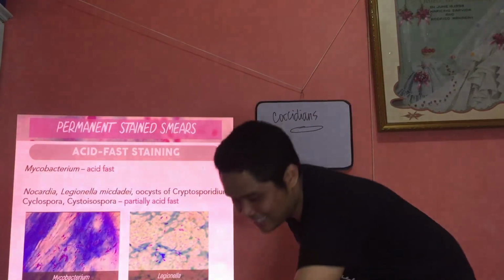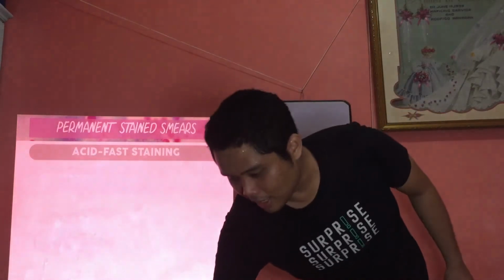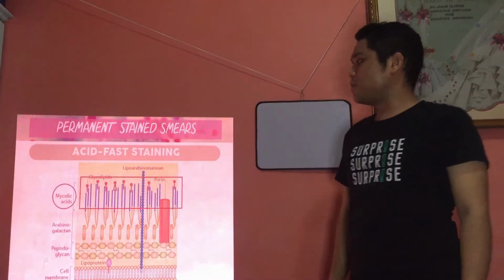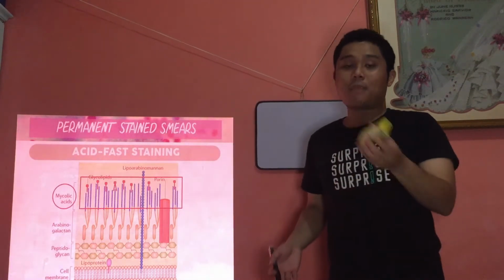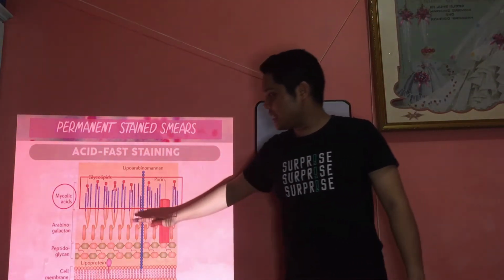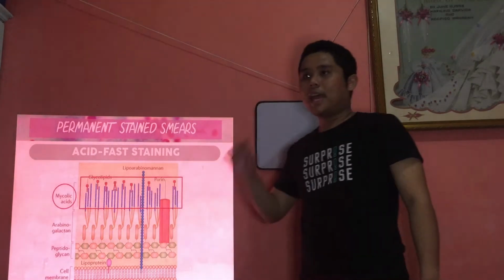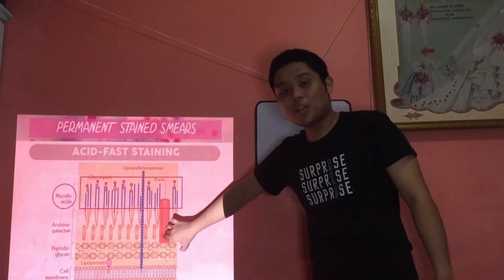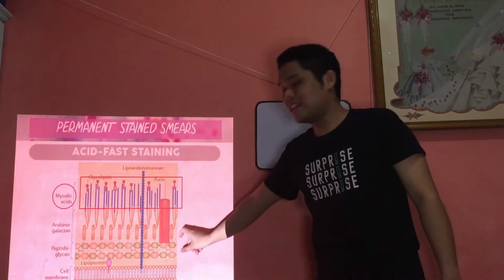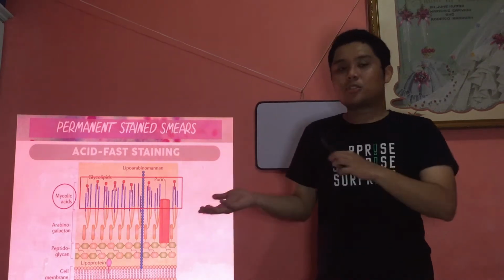Alright, now we go to a diagram of how the staining occurs. Just a diagram of the mycolic acid cell wall. So, this is the cell wall of your bacteria that has mycolic acids, or parasites. We have here, in normal bacteria, gram-positive, gram-negative, a peptidoglycan layer. And in the gram staining results, it is in this layer that different bacteria differ in the content of the peptidoglycan. And that is the principle of your gram stain.